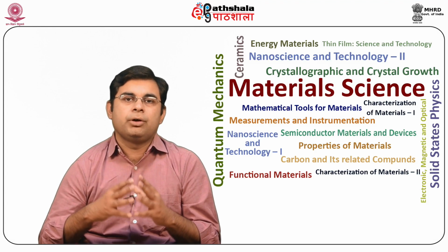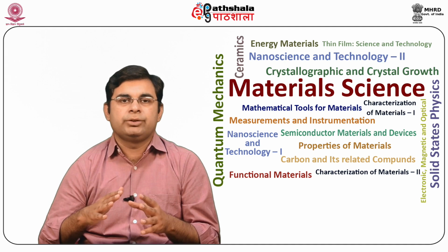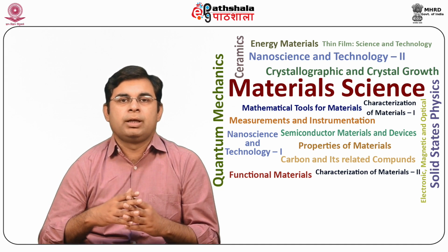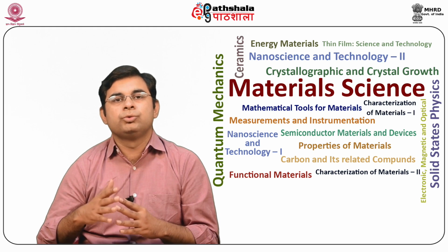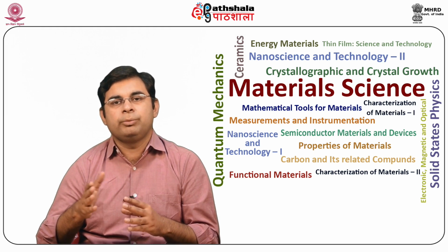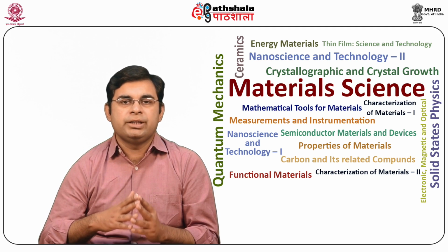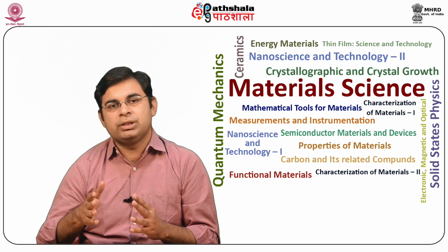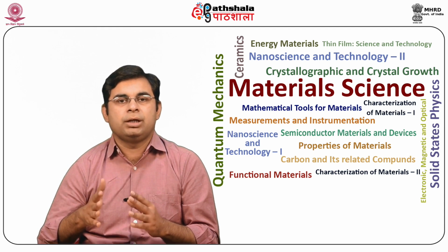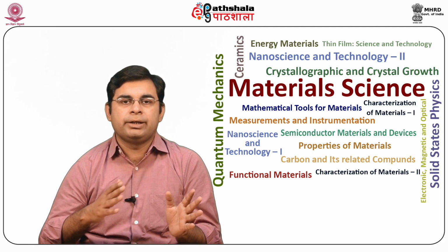Advantages: the optics of FTIR instruments have much larger energy throughput, that is 1 or 2 orders of magnitude, as compared to dispersive instruments, which have limited throughput due to the use of narrow slit widths. It should be noted that the interferometer is free of the problem of stray radiation because each IR frequency is effectively chopped at a different frequency. That means any radiation other than the frequency that is to be radiated onto the sample is removed by the interferometer.